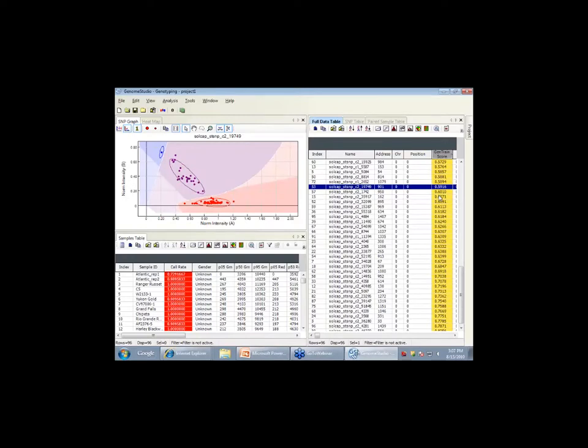So the question is, can this technology handle, say, a SNP that has more than 2 alleles? The answer is no. But is that something you want to do? Probably not. It makes it pretty difficult, actually. And for the most part, we haven't seen too many of those in our data. We've designed only what we've seen, at least on the current sequence, biallelic SNPs, as opposed to triallelic. You see triallelic, but they're not that common.